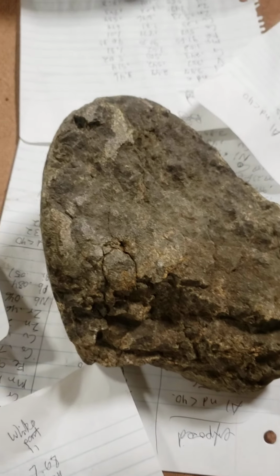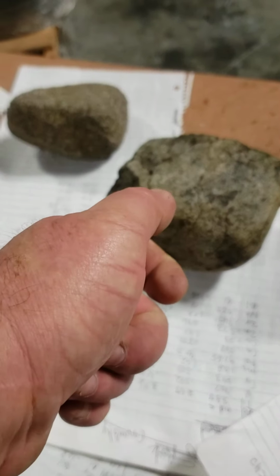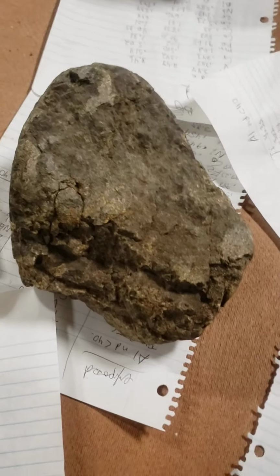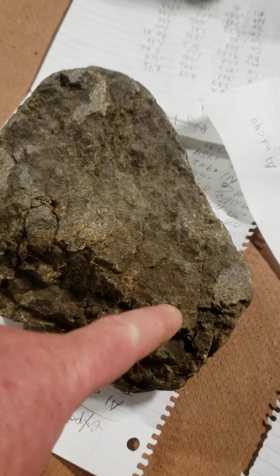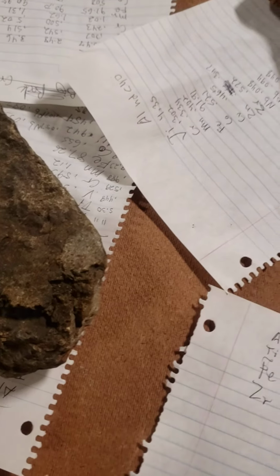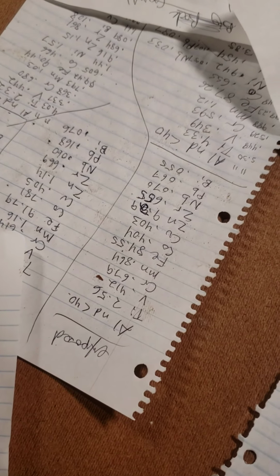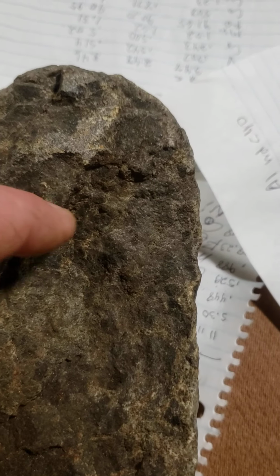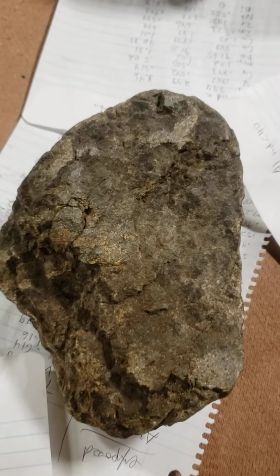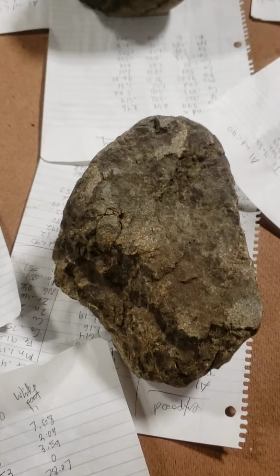So this is the only one out of all them samples. It took me like 3 hours with the XRF gun. And of course, I put the gun on there and I'm waiting, and I'm looking for nickel at first. Because when you have it tested, they say take a little sample off there about the size of a quarter and send it in. Well, if you send in this piece right here, it's going to show a reading like that right there. Of course, it's going to have a bunch more stuff, but it's not going to show any nickel. If you take a chunk out of right here, or over here, maybe even under here, and send it in, then that's going to have some nickel in it. Good percentage, it's a 1 point something, so that's a pretty good percentage, 1%.